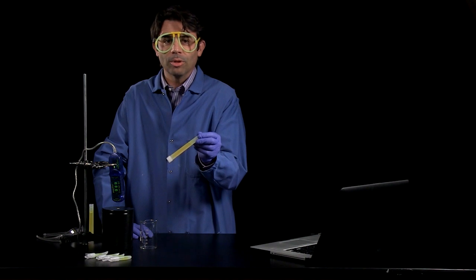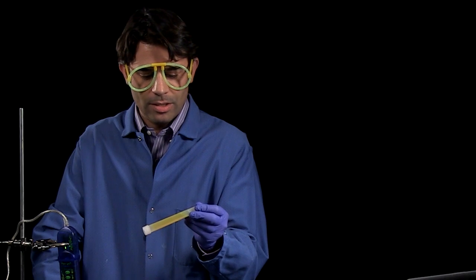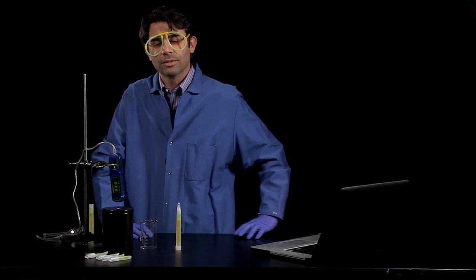Glow sticks are an example of a chemiluminescent process. That means the reactants react to produce energy in the form of light. We're going to study that light using our light level sensor.